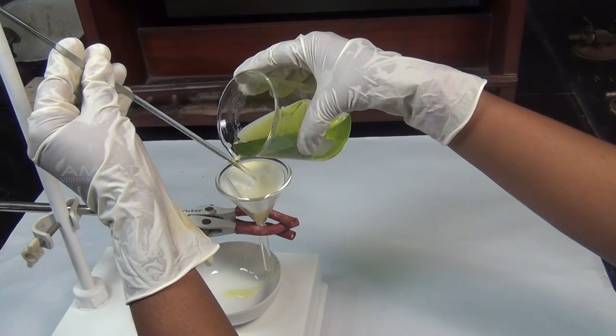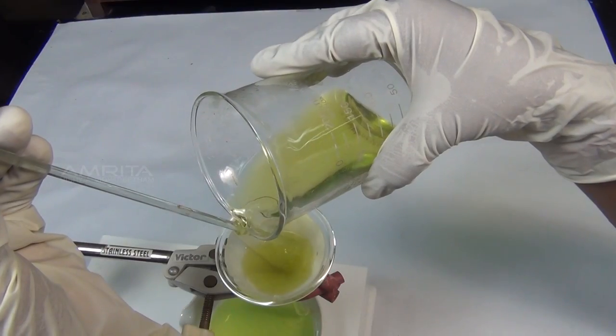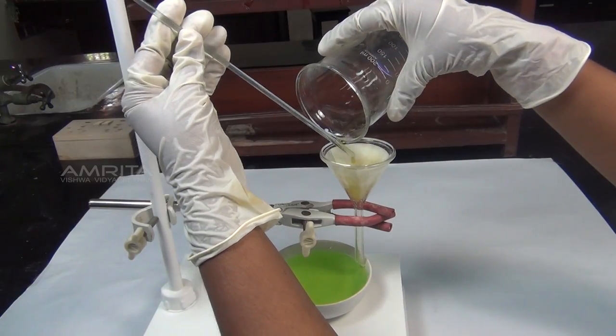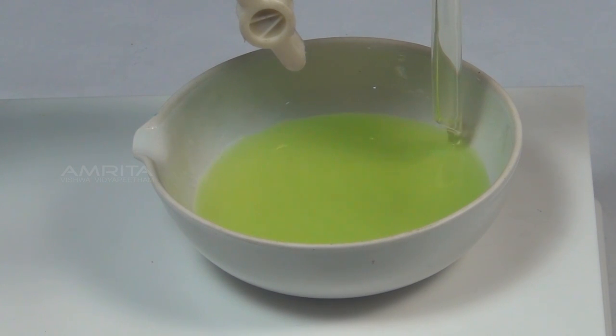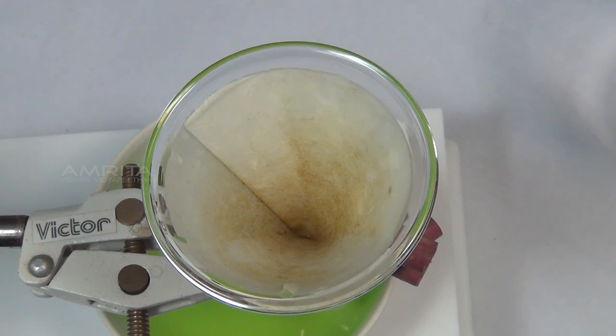Then filter the solution into a china dish using a funnel and filter paper. The stem of the funnel should touch the wall of the china dish to avoid the solution splashing out. After filtration, the insoluble impurities are left behind on the filter paper.